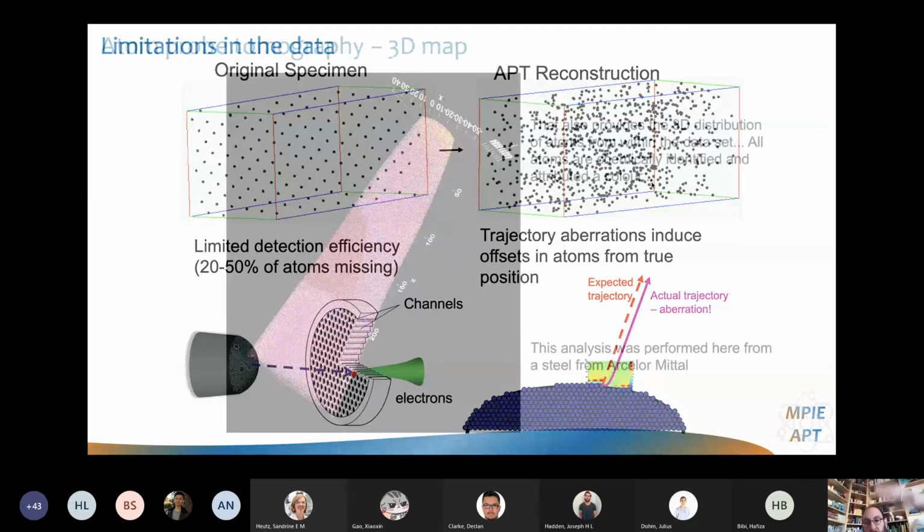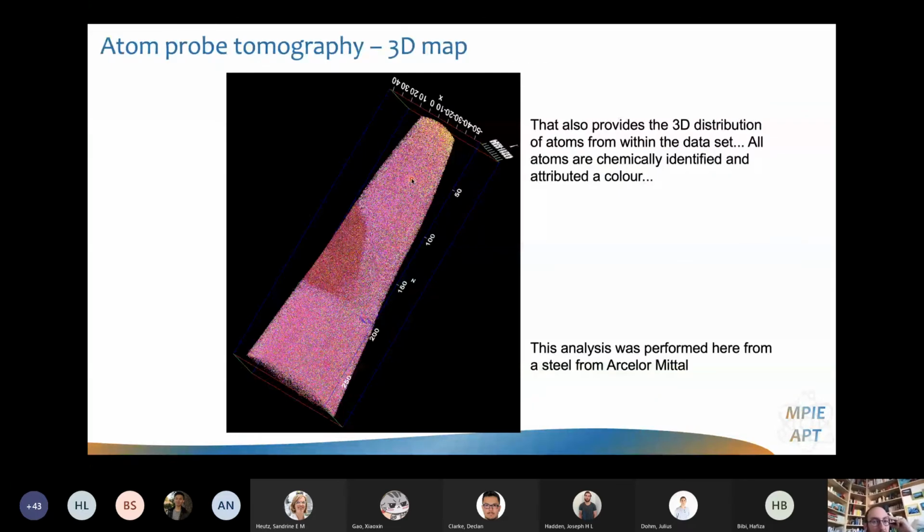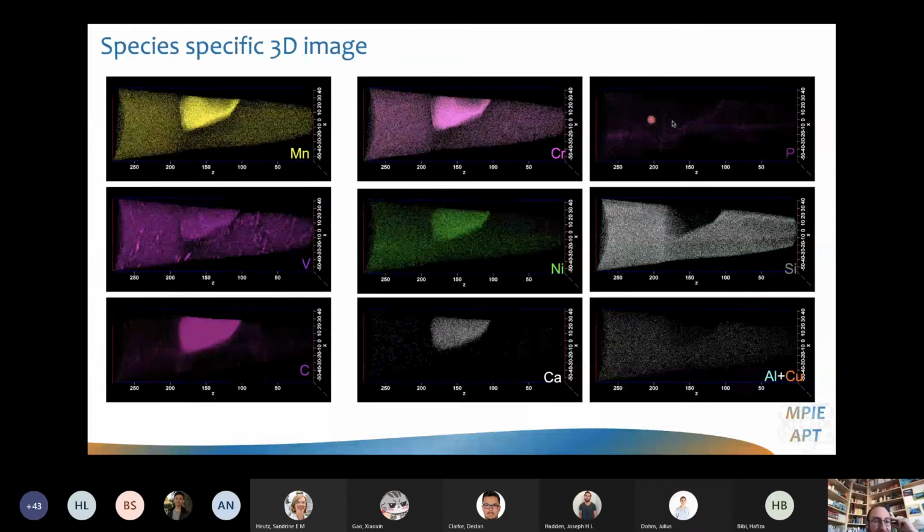So when we look at this piece of steel, I've shown you the mass spectrum before that we've analyzed. What we can do is look at where all of these elements are sitting inside of the data set. So how is manganese partitioning between this particle that happens to have a lot of carbon, and it's probably a carbide, and here the matrix, which in this case is ferritic. And I also have these elongated features rich in vanadium, which happen to be dislocations that are covered with vanadium. So that's where the atom probe is strong, in this three-dimensional distribution of all of the elements. And we can actually go down to measuring the relatively precise composition of all of these species and all of the different objects that we are imaging.